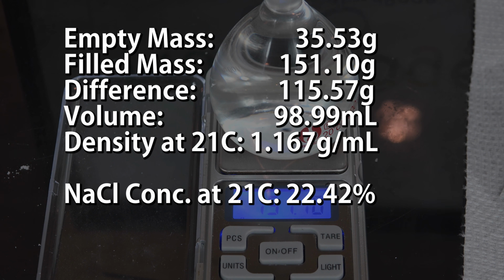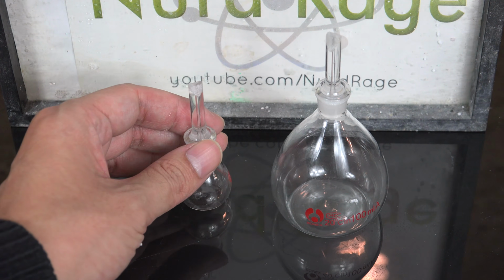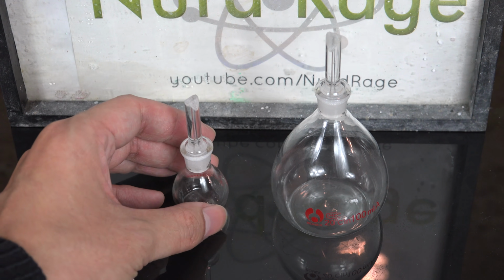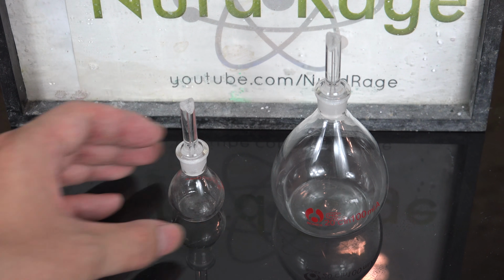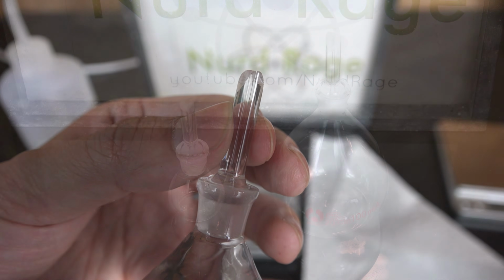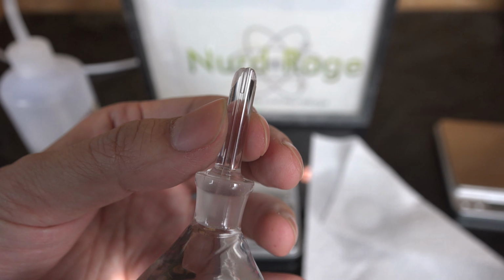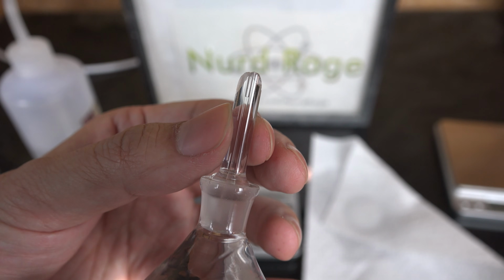So as you can see, despite the extra work, these are much more accurate than hydrometers and graduated cylinders. And they're not even that expensive. I got mine for just $10 each from AliExpress. But you do get what you pay for. Professional models can be hundreds of dollars, and the primary issue is how well the stopper fits. As you can see with these cheap units, the stopper is not perfectly fitting and wobbles a bit. This can give a tiny error in the volume.